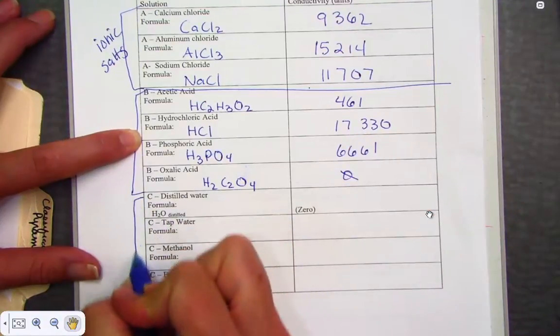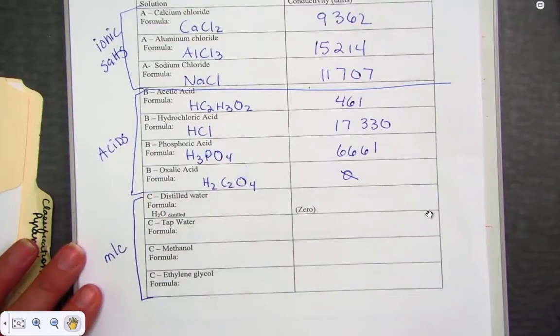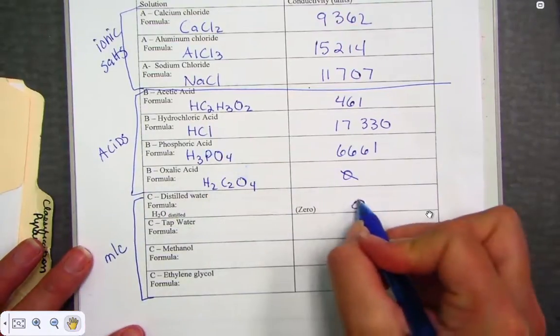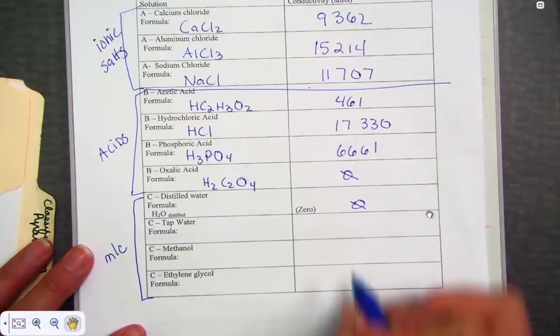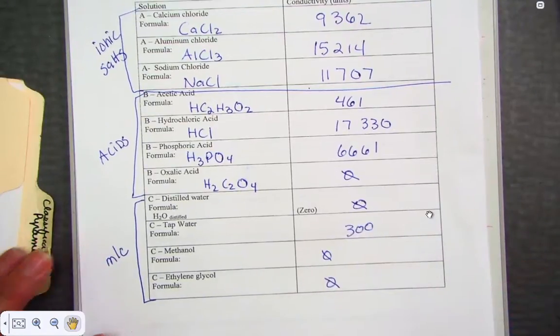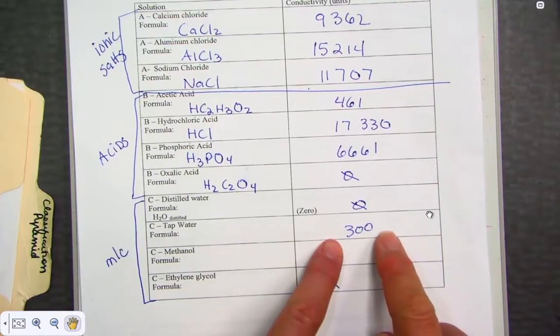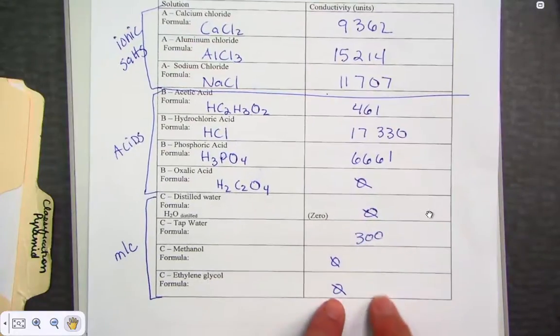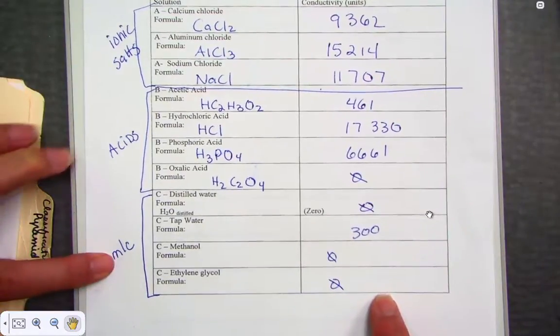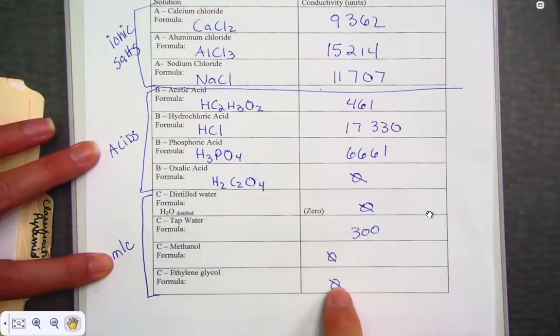The last set, we have these molecules, molecular compounds, which we would know to be non-conductors. So again, if you saw some sort of reading, I'm sure it was just because I mixed the solutions in a water solvent from the tap water. The tap water, of course, we know has dissolved ions in it. I have some sort of small reading for tap water, and comparatively, significantly small numbers down here. With molecular compounds, we know these to be non-conductors, very significantly small number.